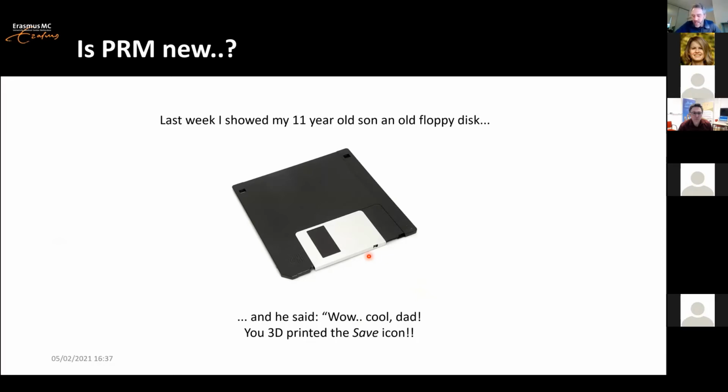So no, targeted detection is not new, of course, but what I want to stress here is that when using Orbitraps, both the selectivity and sensitivity have dramatically increased as compared to MRM studies on a triple quad. And this in fact opens up a lot of possibilities.